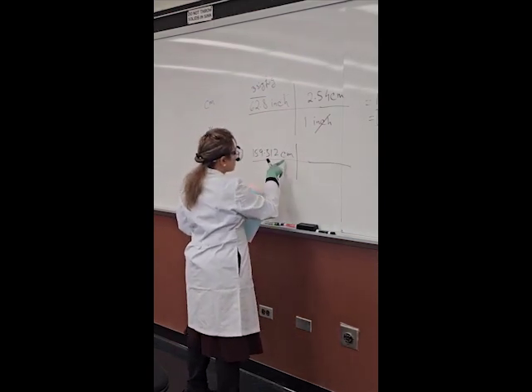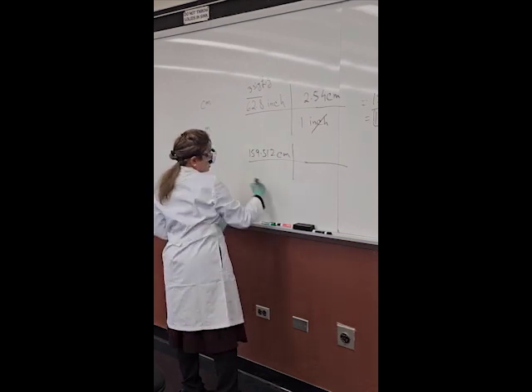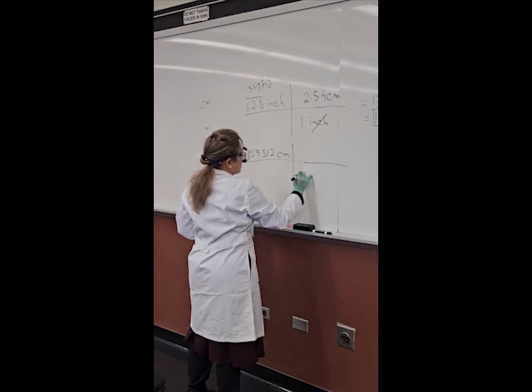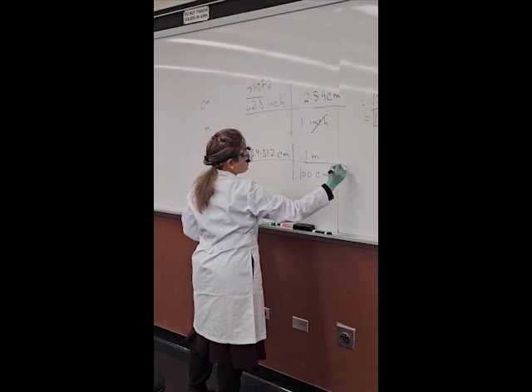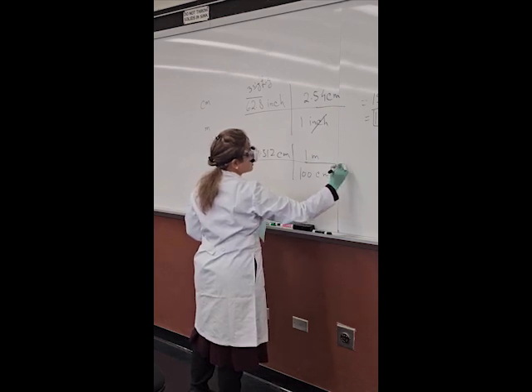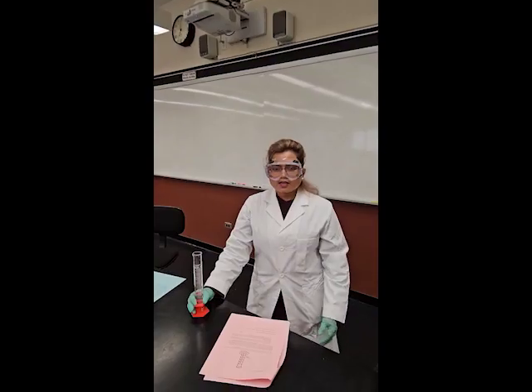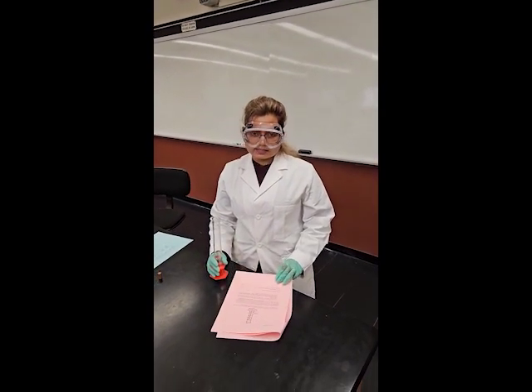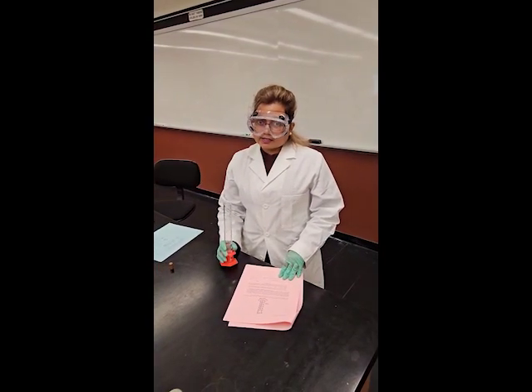Centimeter. The same thing, I want to cancel my centimeter and I want my answer to be in meter. So 100 centimeter, 1 meter, times. So come to the second part, in which we are trying to find out the density of metal. Okay. First, we need a graduated cylinder.